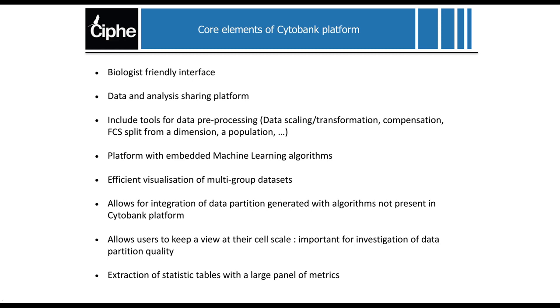so that you can build efficient visualization of multi-group data sets, and also that the Cytobank platform allows for integration of data partition, meaning clustering, generated by algorithms that may not be present in the Cytobank platform, but you can still use to actually visualize your data on it. And very importantly, it's a tool that allows you to keep an eye on your cell scale, which is important for investigation of the quality of the clustering and partition of your data, because sometimes you really need to look. You might have some difficulties there. And finally, you can extract statistical tables with a large panel of metrics that could be useful for your project.